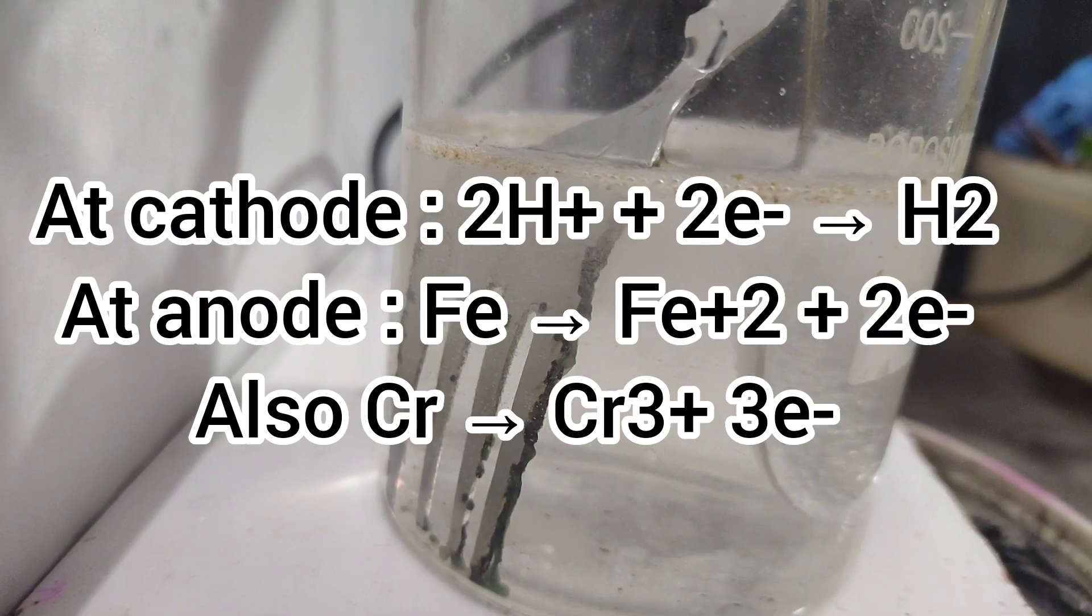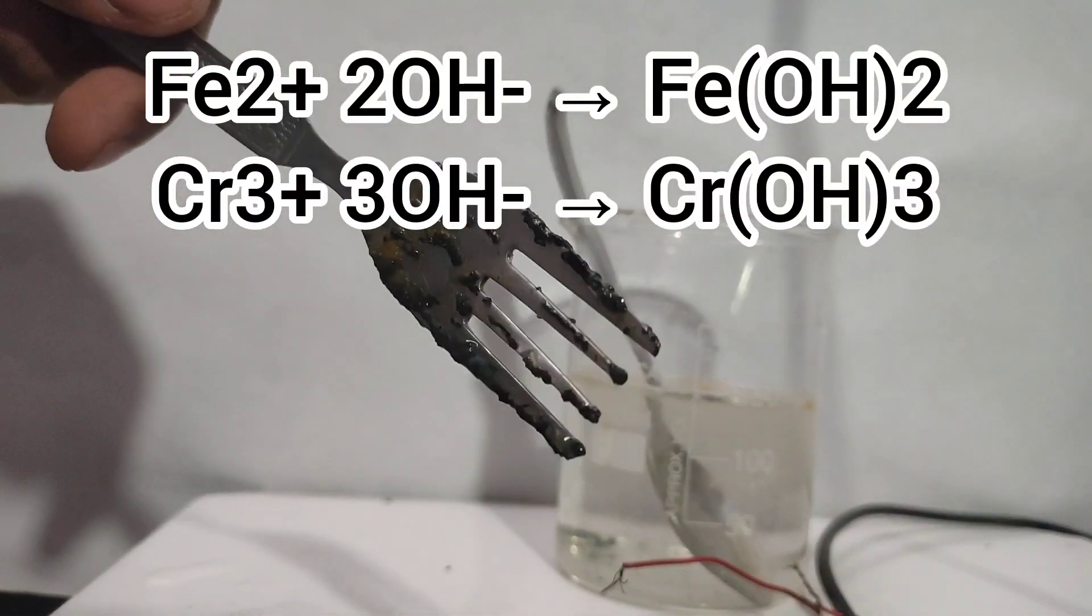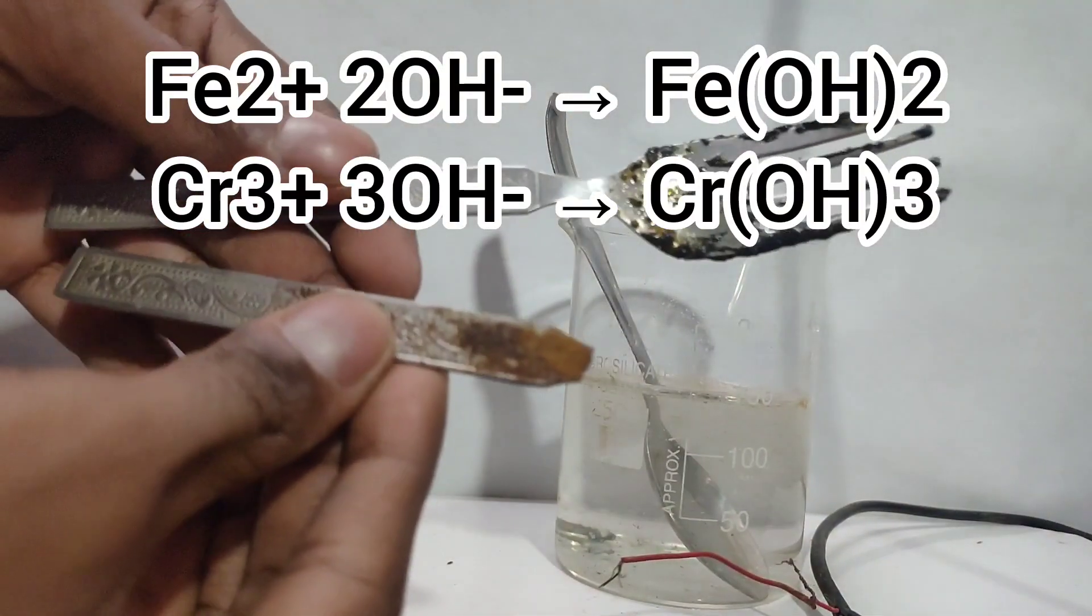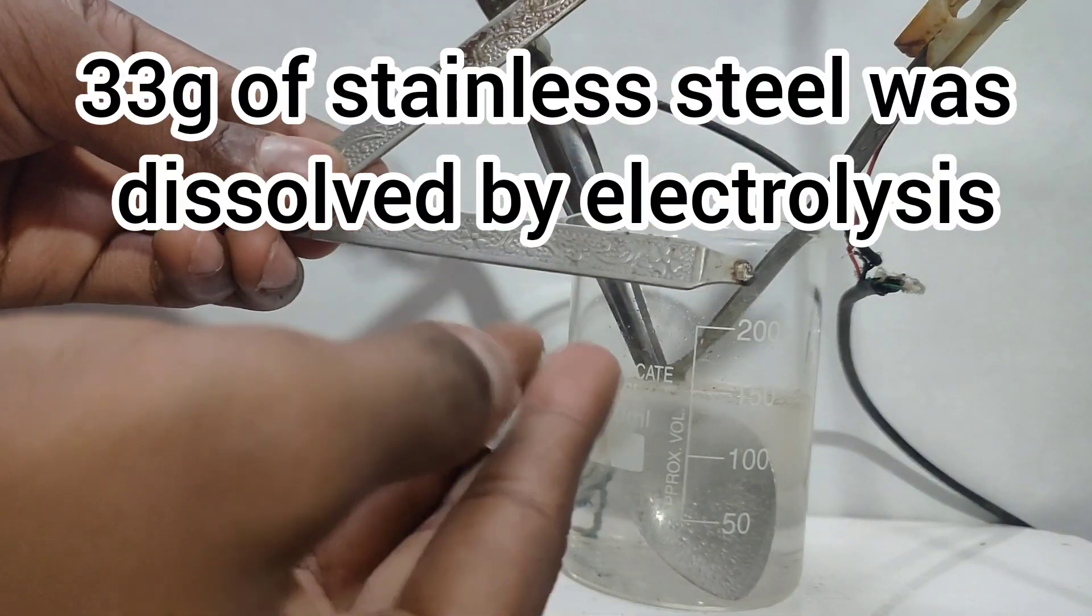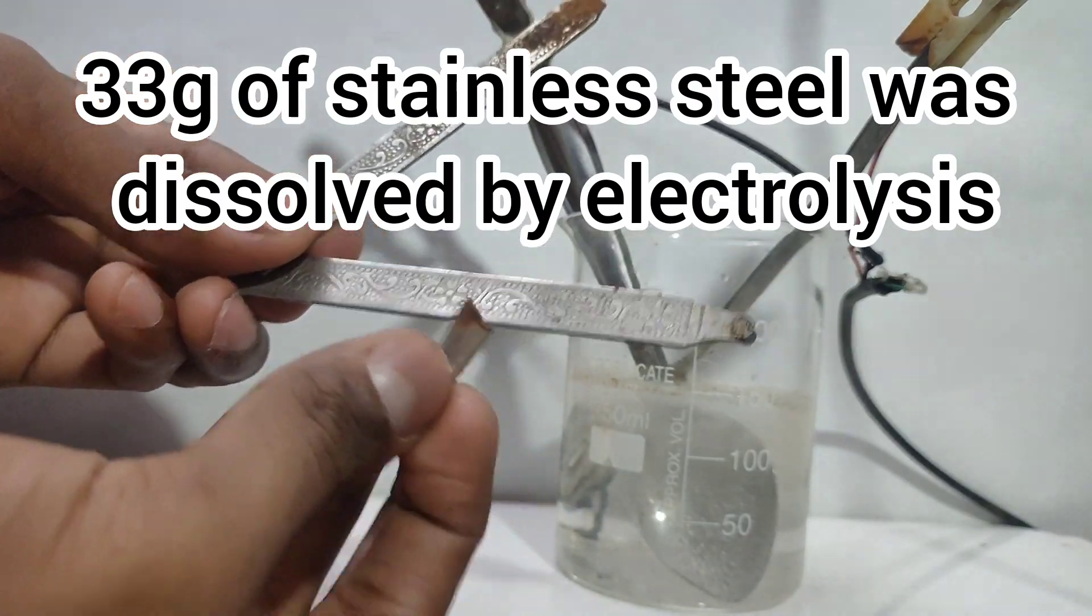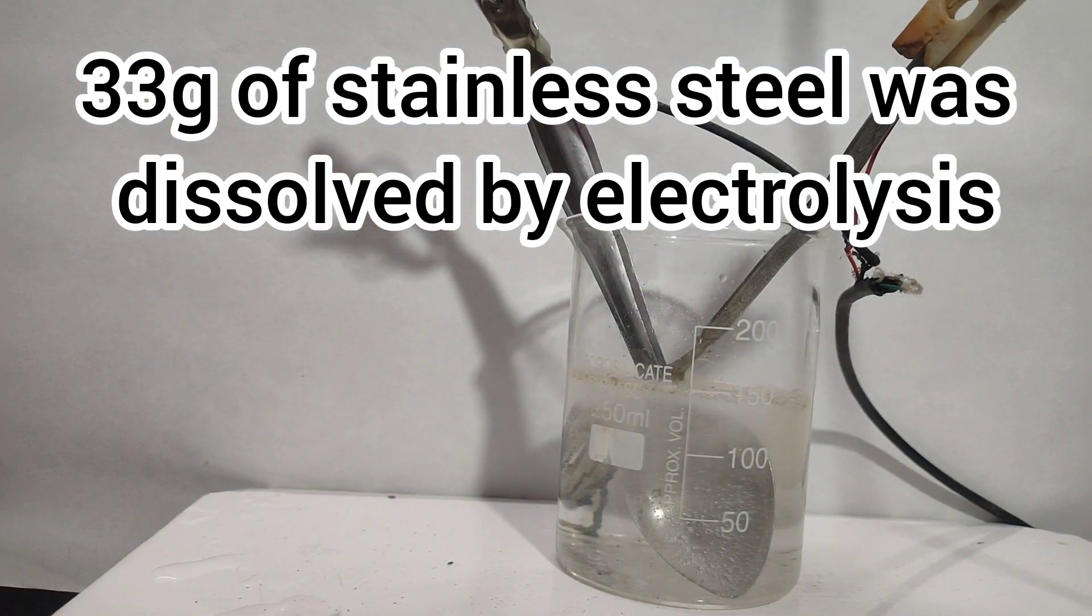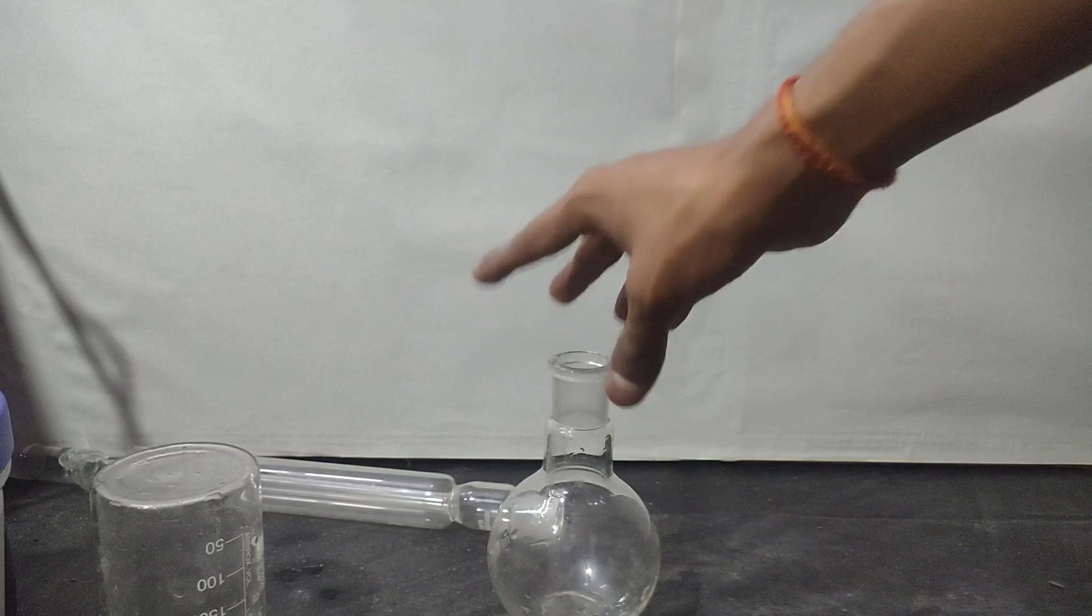The metal in the steel, which is iron and chromium, is oxidizing to their corresponding hydroxides. I have already dissolved two forkheads and one spoon by this method, which measures out to be 33 grams. I will show you the precipitate formed later in this video.